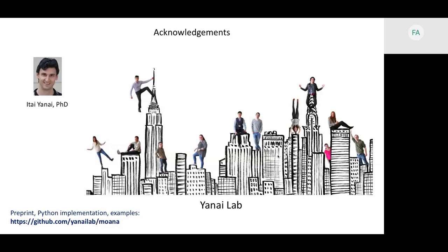So that's an interesting question. It doesn't really matter that much, because it's essentially up to you. You can decide that you only want to define 2 clusters and then keep going with each of the 2 clusters, which is what we've done here. We typically limit it to 2 or 3, because in 2-dimensional PCA space, it's often very difficult to distinguish between more than 3 populations.